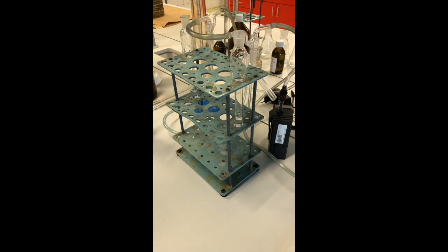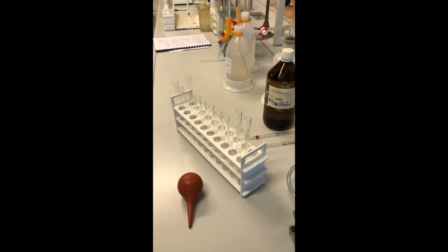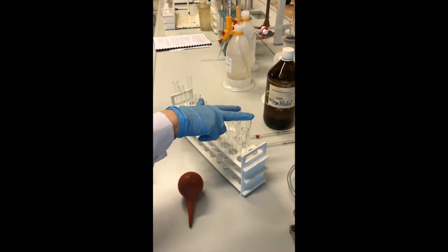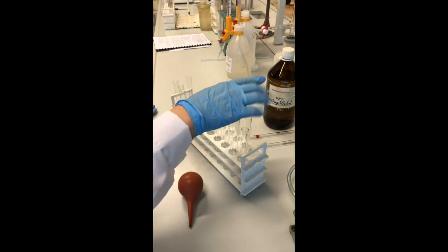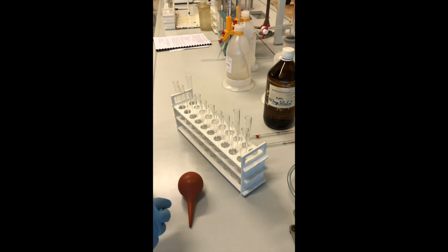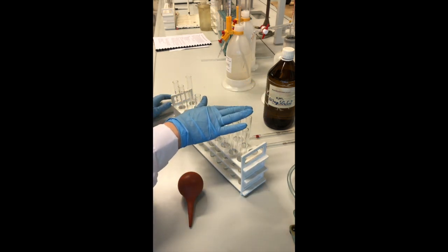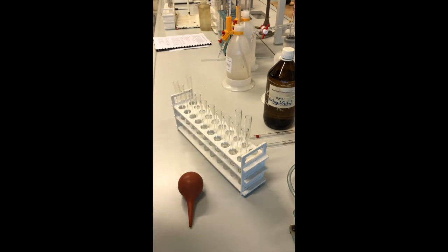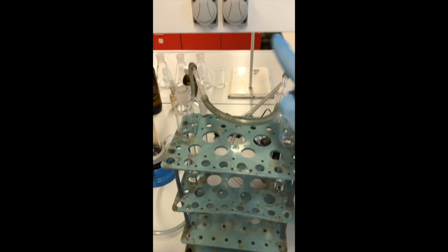Okay, so now we have the scale of standards and our 2 samples. The important thing is that we expect the higher concentration to be in the right sample and the lower concentration in the left sample, because the air goes first to the first scrubber and then to the second.